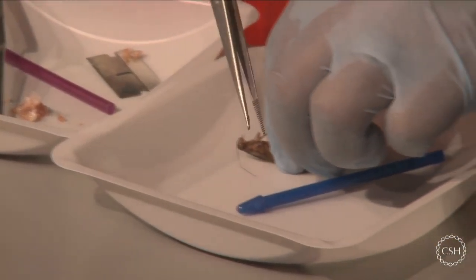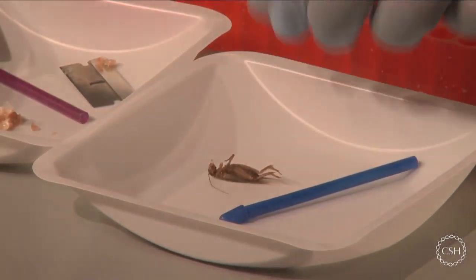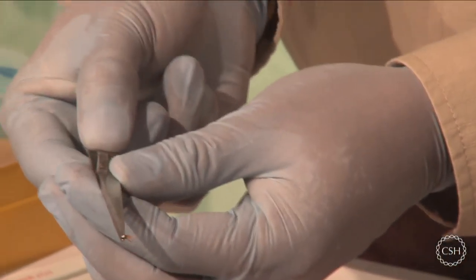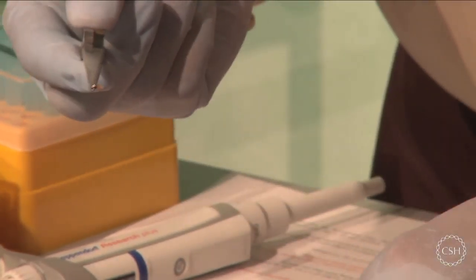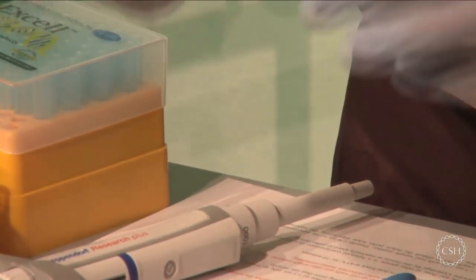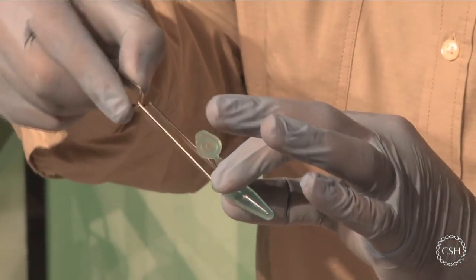So all I want to do is take a leg, and a leg will most likely be more than enough to do this experiment. Now I have a piece of my leg, or a portion of the leg, and that will be enough to do my reaction. So I'm going to take that, and I'm just going to add that to my next test tube.